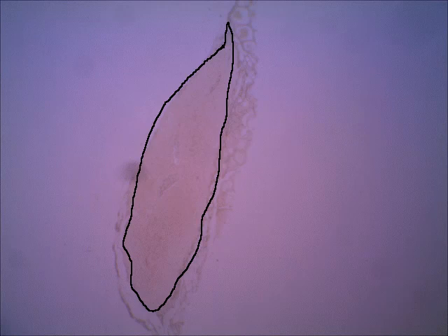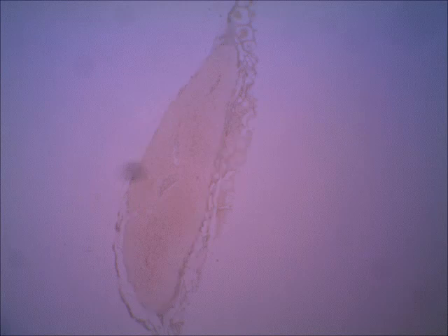But then you also can see some little follicles attached to it. So these follicles are actually thyroid follicles that got pulled off the thyroid gland when they were preparing this slide for parathyroid. Okay, if we look at it on a higher view, on this next slide, you can see the follicles on the right, and then all of the big strip on the left will be the parathyroid gland.